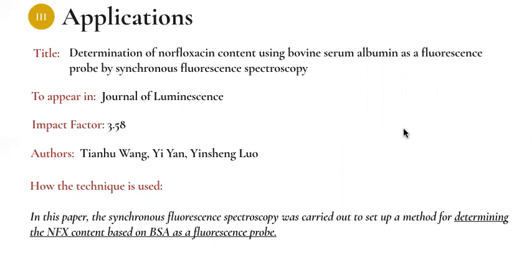However, NFX promotes antibiotics pollution as it is difficult to degrade in aqueous solution and its residues have been detected in sewage and other environments. Hence, it can potentially threaten people's health. Since NFX is a fluoroquinolone antibiotic, in this paper, synchronous fluorescence spectroscopy was carried out to set up a method for determining NFX content based on bovine serum albumin as a fluorescence probe.